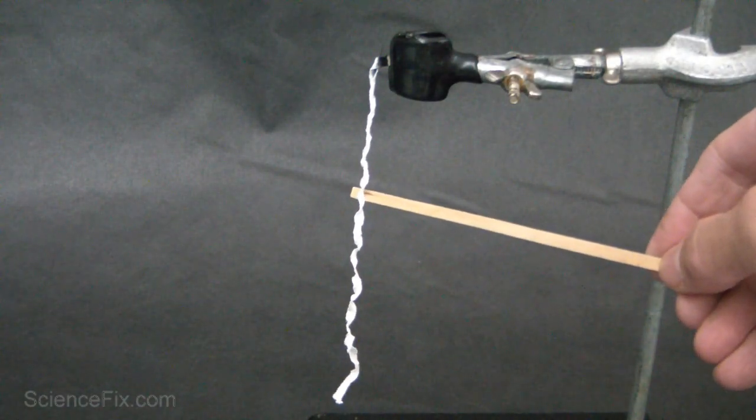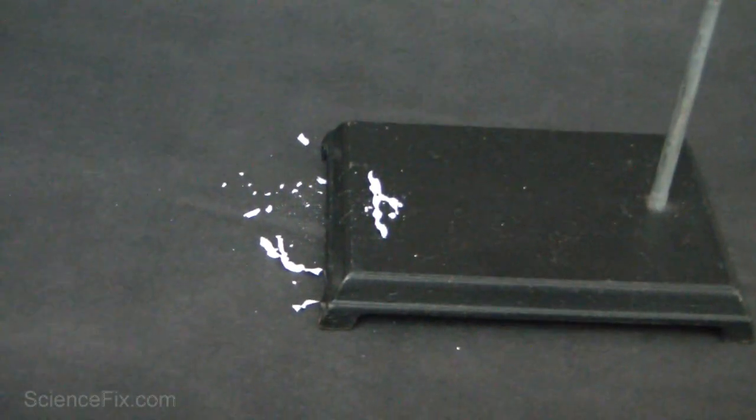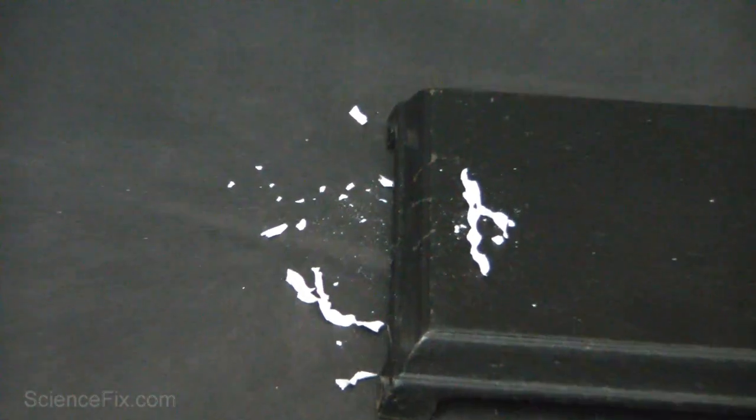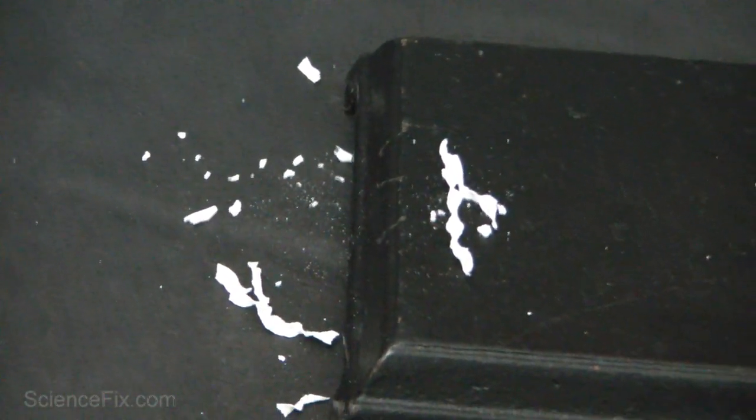Now we have an up-close look at the magnesium oxide. You can see it has a white color. That's one of the properties. And you can see it's very brittle. Basically, it's going to turn into a powder if you touch it.